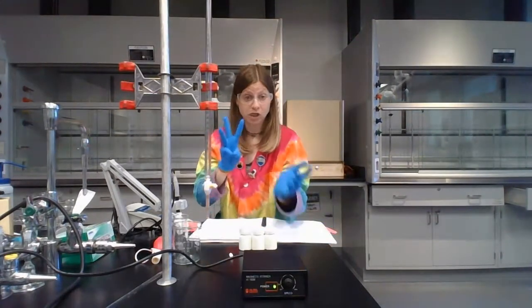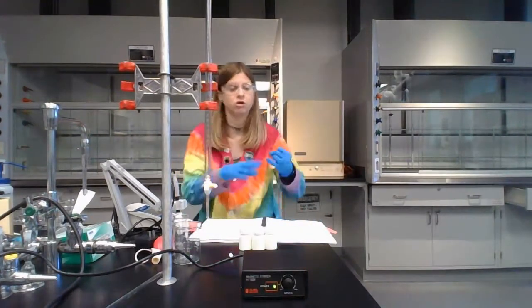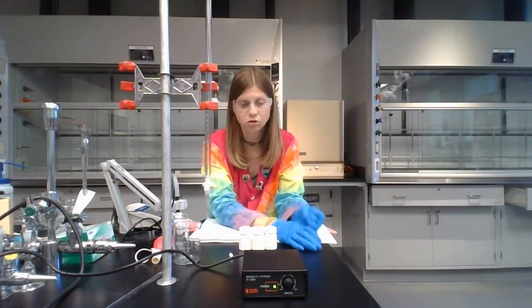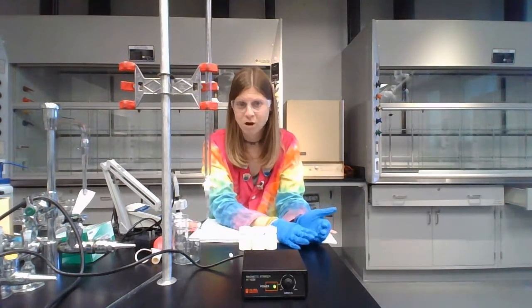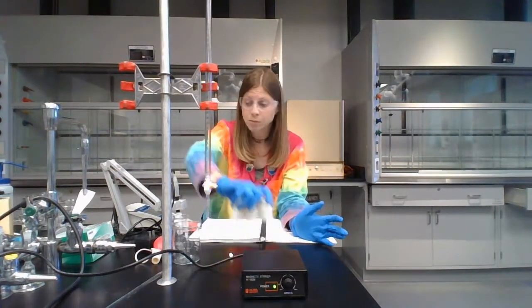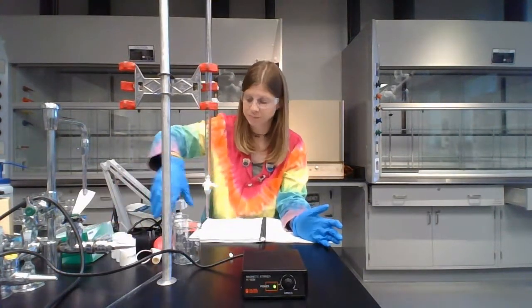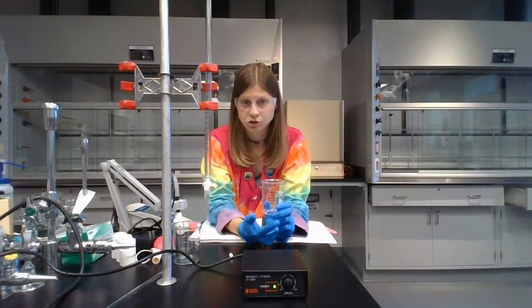So we're going to do 3 trials of this, so you will need 3 beakers. The beakers need to be either 150 milliliter beakers, or if we don't have enough of those, then 250 milliliter beakers. They cannot be smaller than 150. They cannot be larger than 250. 150 is really the best, but we don't always have the exact number that we need. You're going to want to label your beakers 1, 2, and 3 for trial 1, 2, and 3.